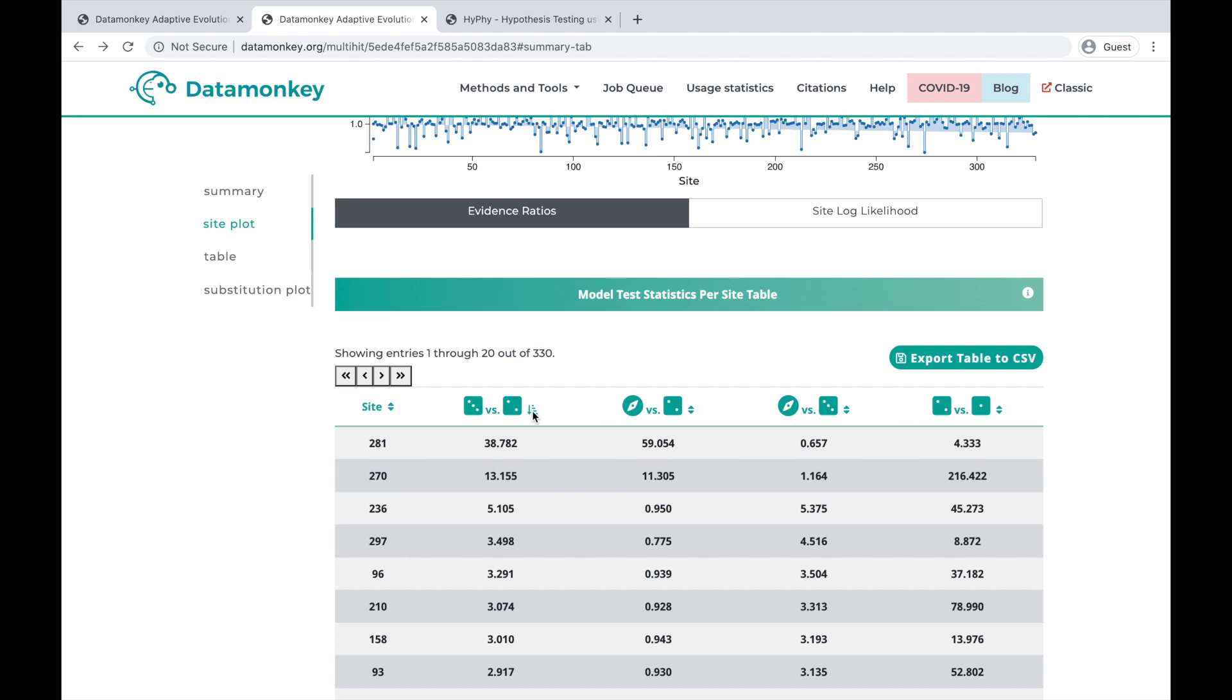We can actually sort this table based on the triple-hit versus the double-hit model likelihood ratio tests, and we can actually see which sites probably contributed highly to that based on their evidence ratio.